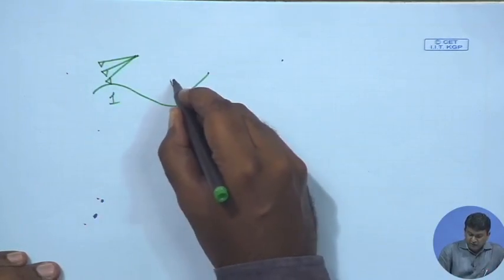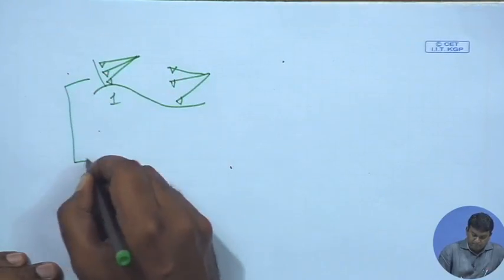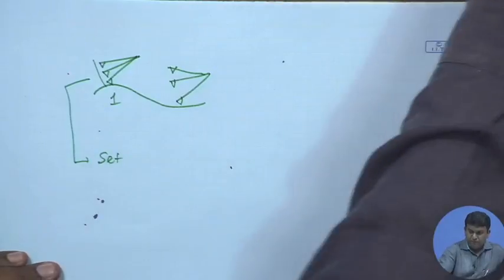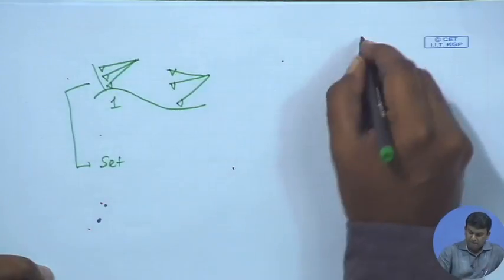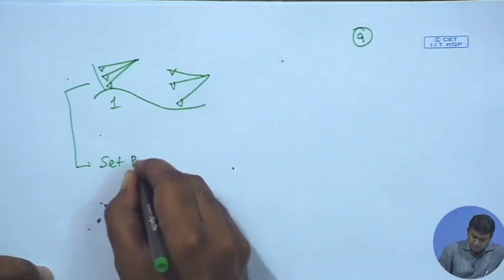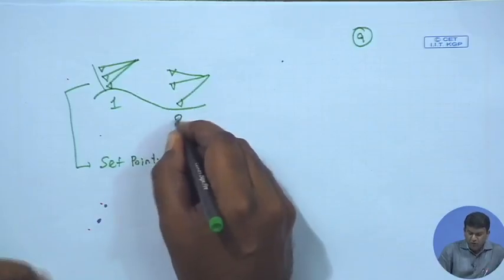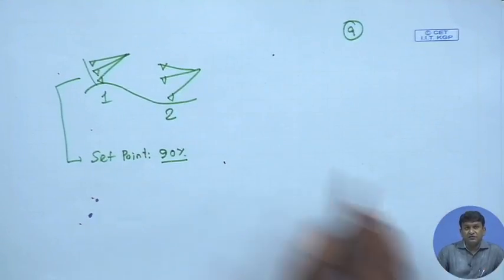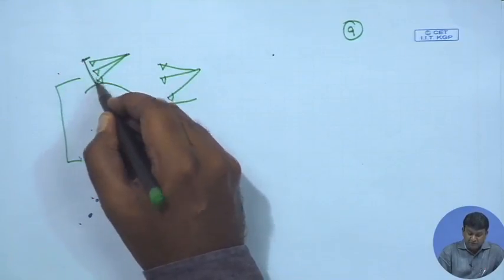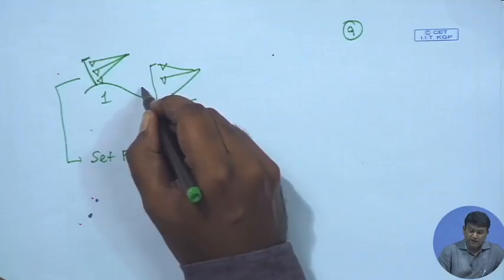So, you have an oscillating cantilever at point 1, which now due to the rastering goes to the second point. Let us say you have chosen the set point to be 90%, you move on to point 2, which is at a lower elevation. So, it is at a lower level. So, essentially the truncated amplitude, which was 90% here, let us say it has gone up to 96%.